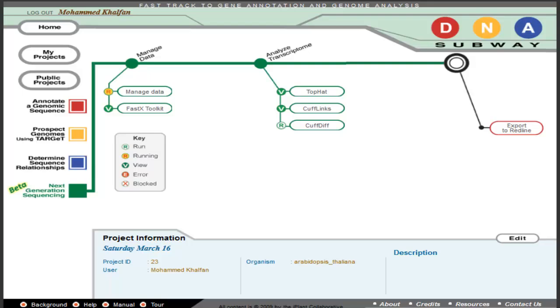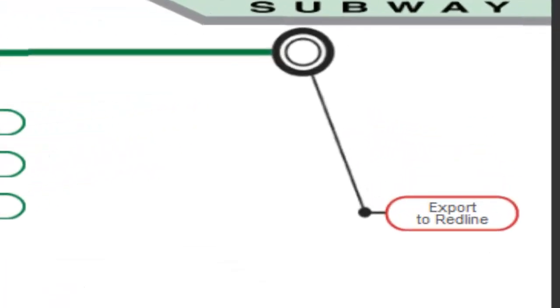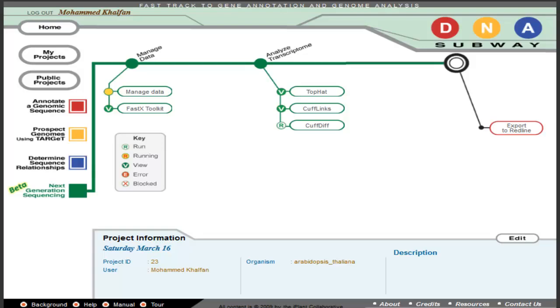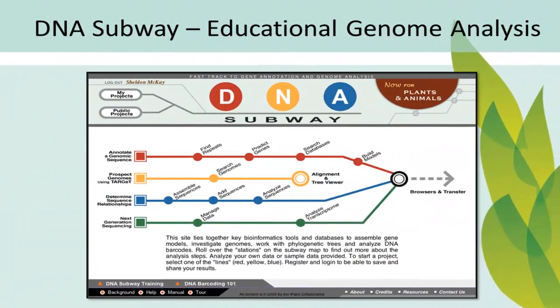Finally, the results of your analysis can be exported to the Red Line, where RNA-Seq data can be used as a class of evidence in annotating genes. DNA Subway, a smooth ride to RNA-Seq analysis.